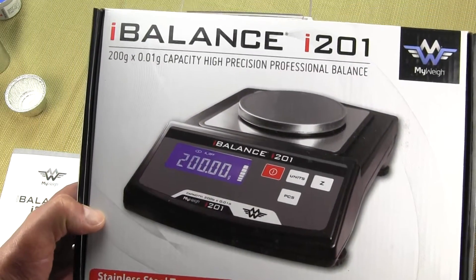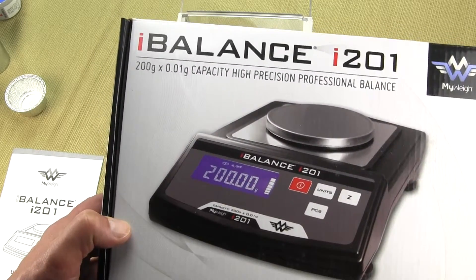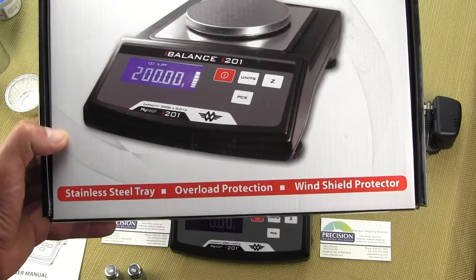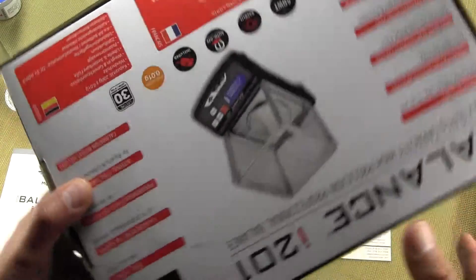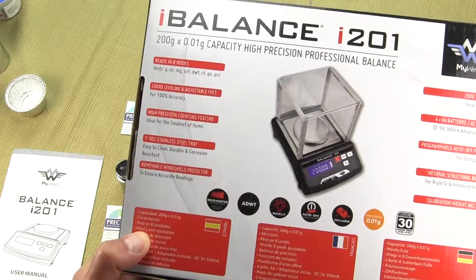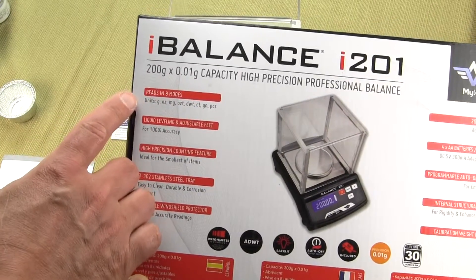The i-201 version 2 comes in a brand new box. MyWay has redone the outer box. You can see there's a nice picture of the i-201, and on the bottom it highlights the stainless steel tray, overload protection, and windshield protector. On the back of the box, MyWay highlights all the features. This is 200 grams by a hundredth of a gram.